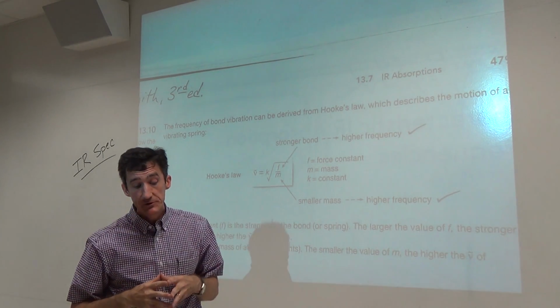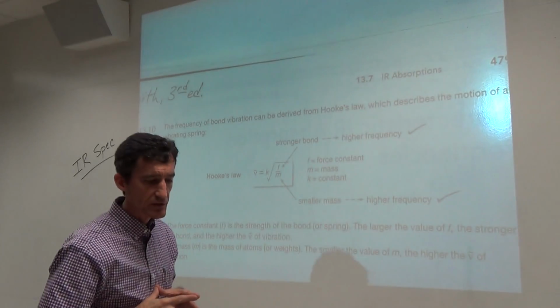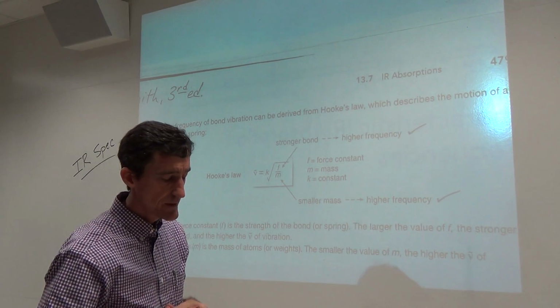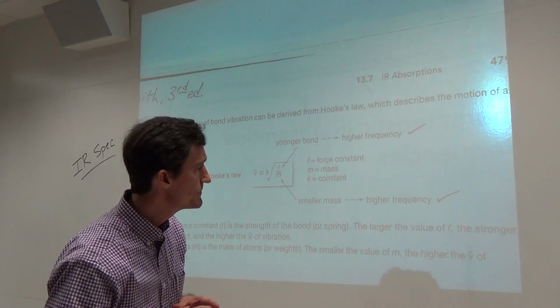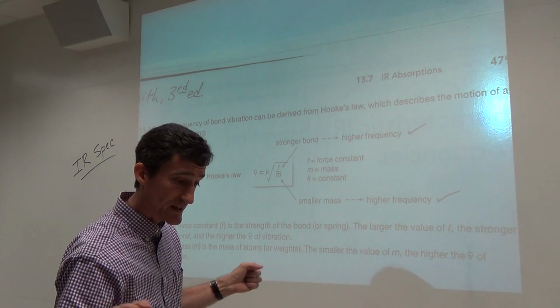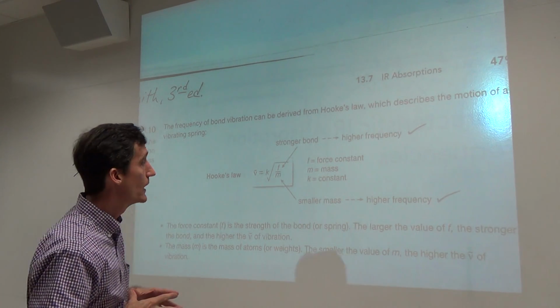How does it absorb the energy? At this point, we're really getting into physics. It has to do with the electrical nature of light and also the electrical nature of a bond. The dipole of the bond is important. It turns out that a bond, or a stretch, that has no change in dipole will not absorb IR.